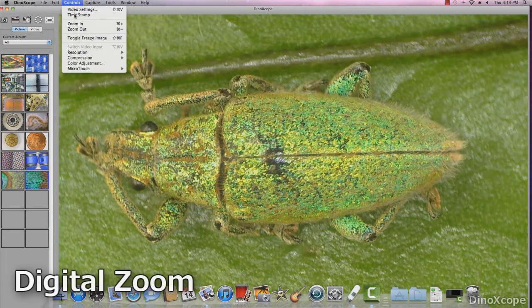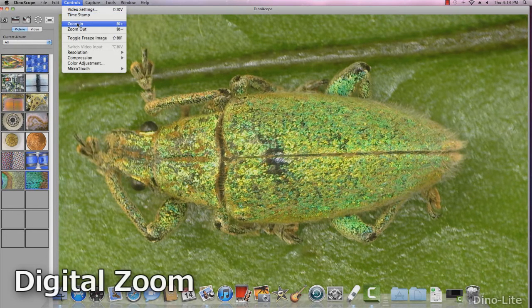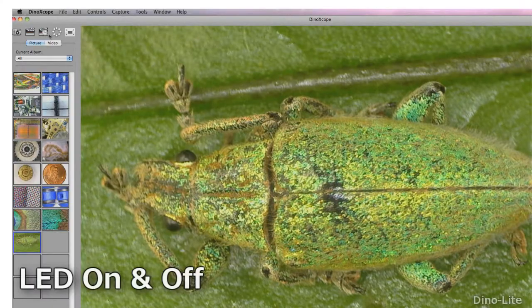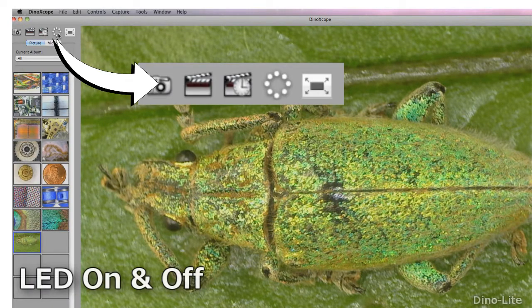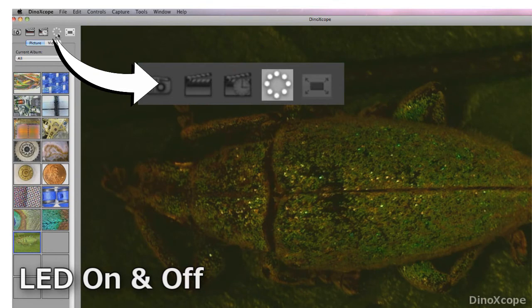Digital zoom allows users to do a slight zoom in on the live image. Use the LED button to toggle the lights on the DynoLite on and off.